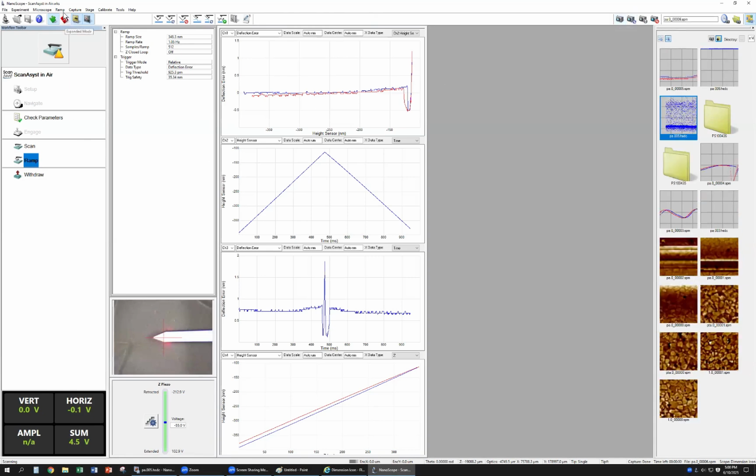At here, if you use the extend module, you can see there is the XY scan. This XY scan, under your scan area, lets you set more data points to get force curves. For example, I set 2 by 2. That means I have four force curves. From one point to another point, you can give the distance.